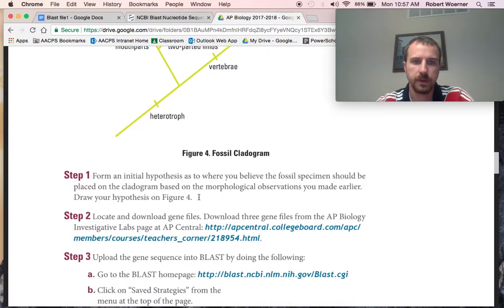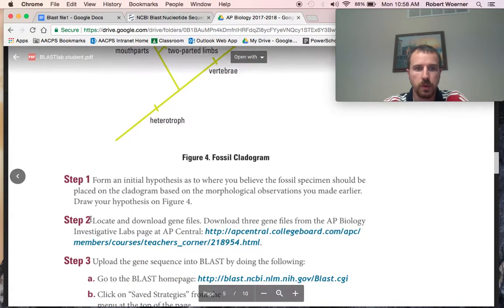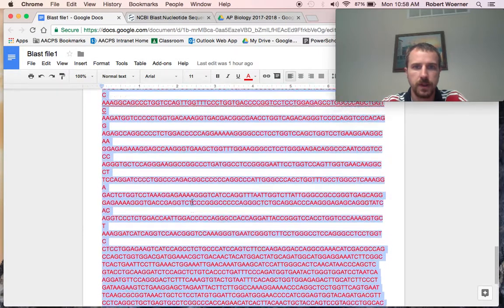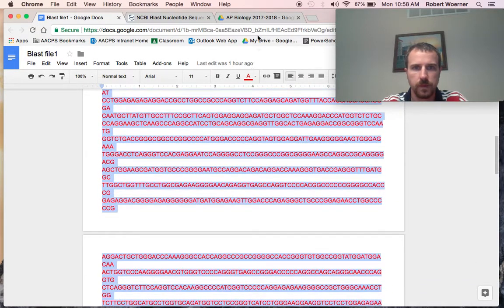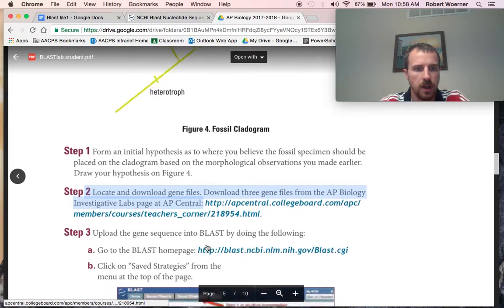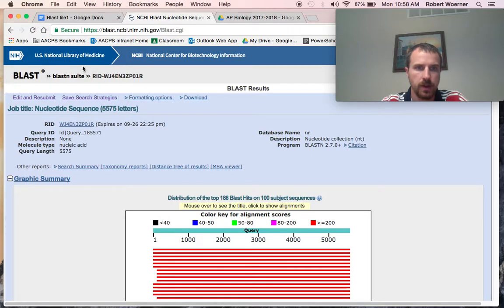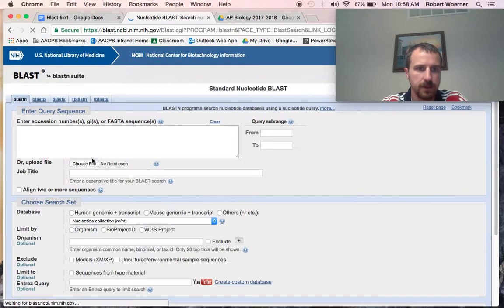So, that was our hypothesis. We determined where we thought it was. Here's where things get technical. We've got to locate and download the gene files. I gave those to you. Those are in the BLAST files right here. So, here is our first one. I'm going to copy that. We're going to upload those genes into the BLAST. So, let's get back to the BLAST website.